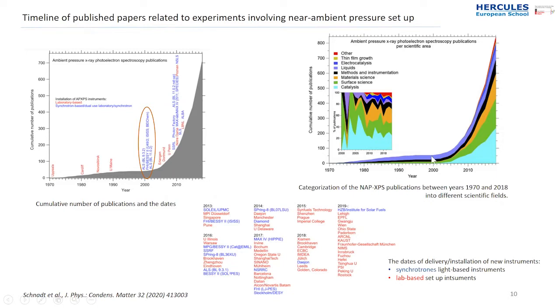The graph on this one is similar. It's just showing the use of near ambient pressure in different fields. In the beginning, as I already mentioned, the main focus was on liquids, and it's getting to the front in the past decade, and the same is true for electrocatalysis.